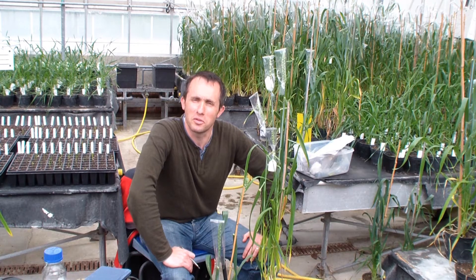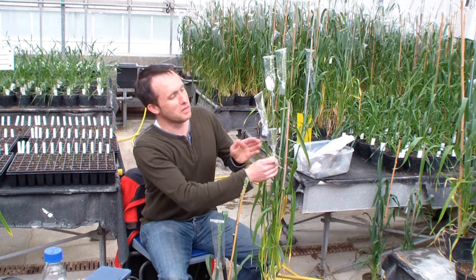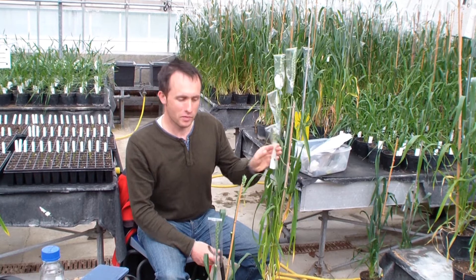Right, this time we're going to start our pollination of the ear that we emasculated earlier. To do this we're going to find the ear that we emasculated — this one was done about three days ago — and we're hopefully going to find a pollen donor which is going to line up nicely so that we can pollinate this ear.